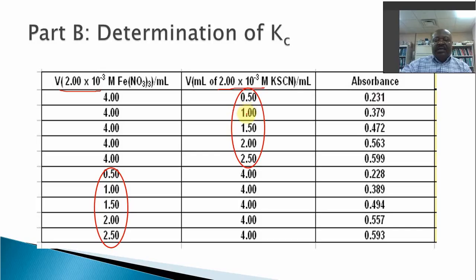Add another, stir, measure the absorbance. Continue until the cuvette is full. You should have dried your cuvettes, otherwise you end up with the thing filling up before you get to the end. And of course, in this case, it's very important to operate the autopipetters correctly. You can check that your autopipetter is working properly by, before all of this, trying to weigh water. You should get a density pretty close to 1. Operate your autopipetters properly so you can get good, appropriate data.